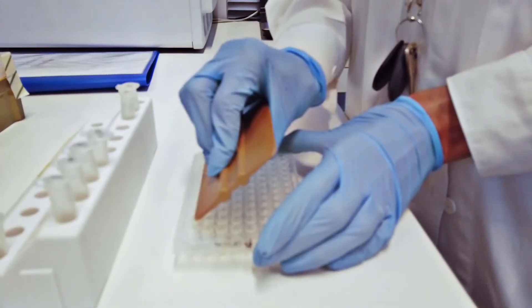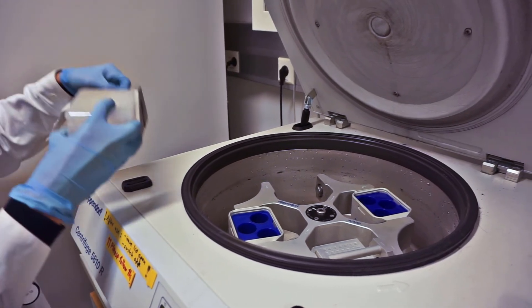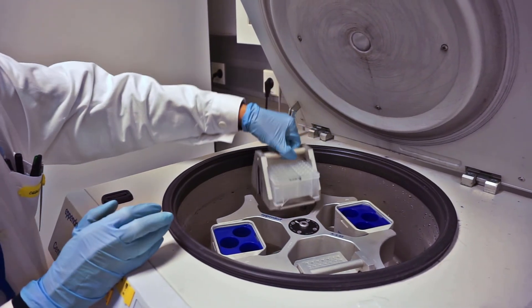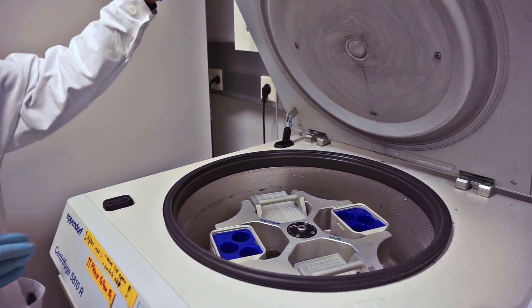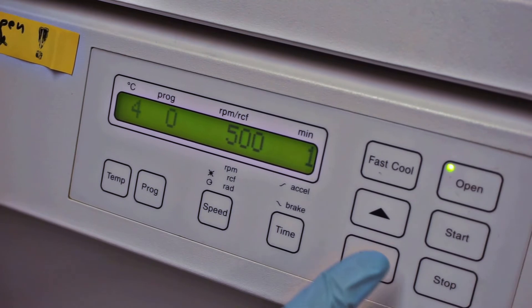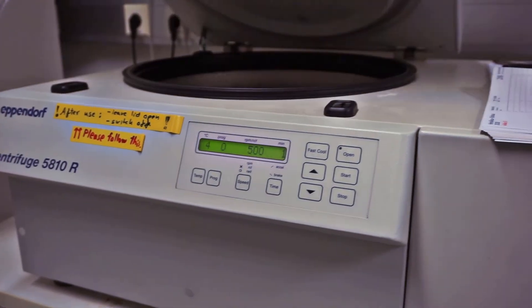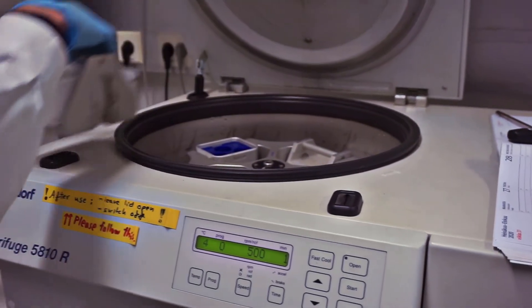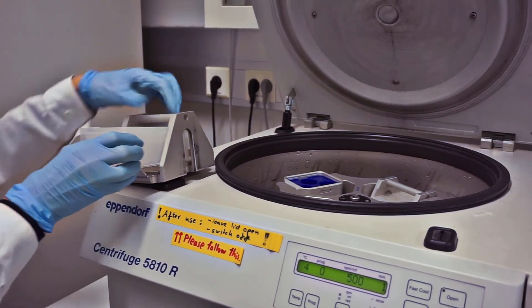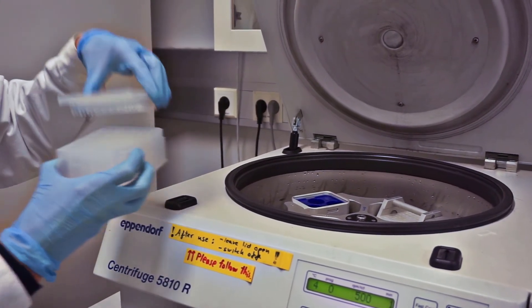Now seal the plate. Spin the plate at room temperature, 500 g for one minute. Place the 96-well plate into the adapter for spinning. After spinning, vortex the plate gently. Make sure the solutions are still at the bottom of the plate. If not, spin again.